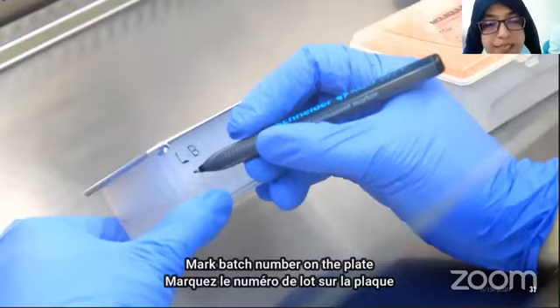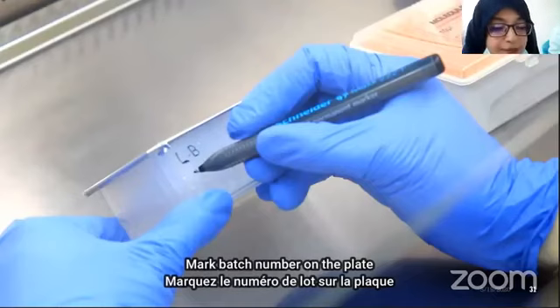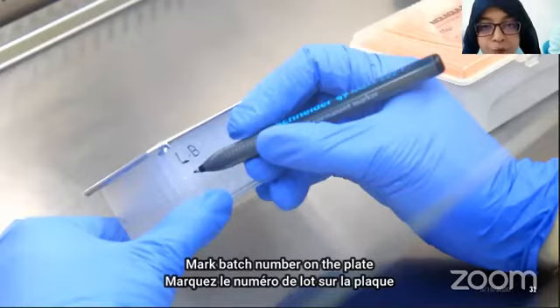This deep well plate has 96 wells, so we add samples from 1 to 96, and at the last we leave some wells only for negative control, which we call extraction negative control, and only positive control, which we add as extraction positive control.